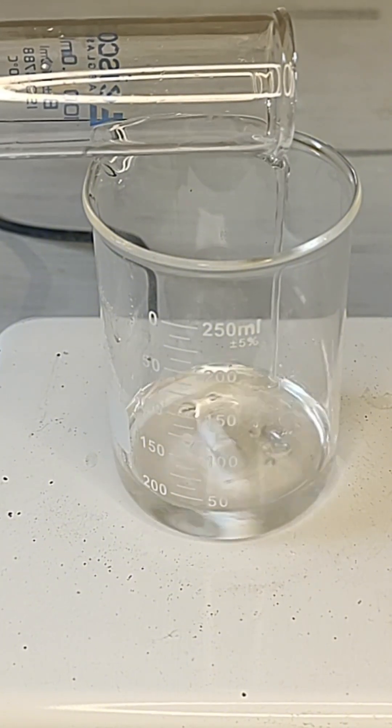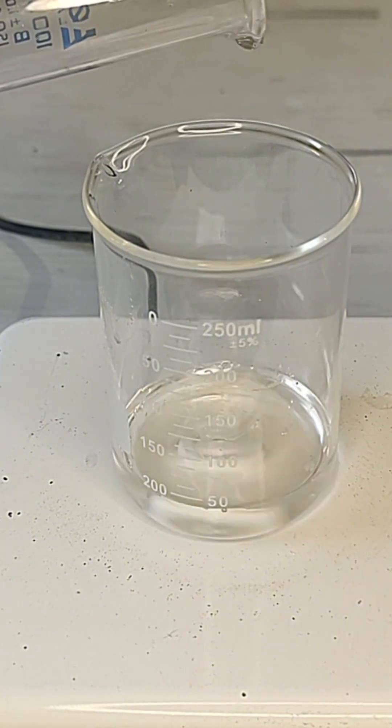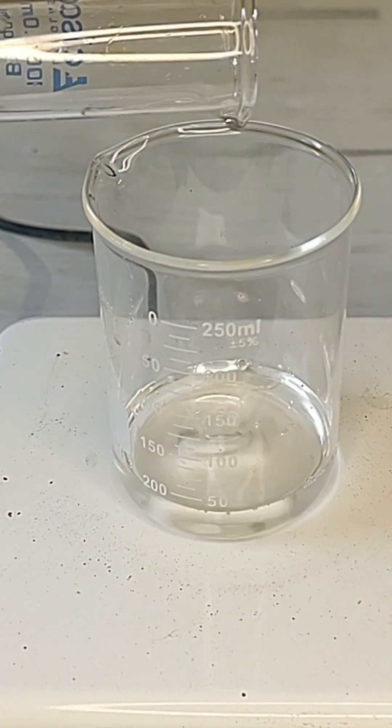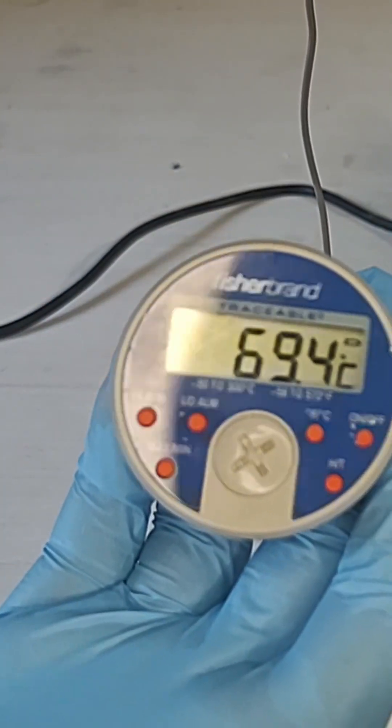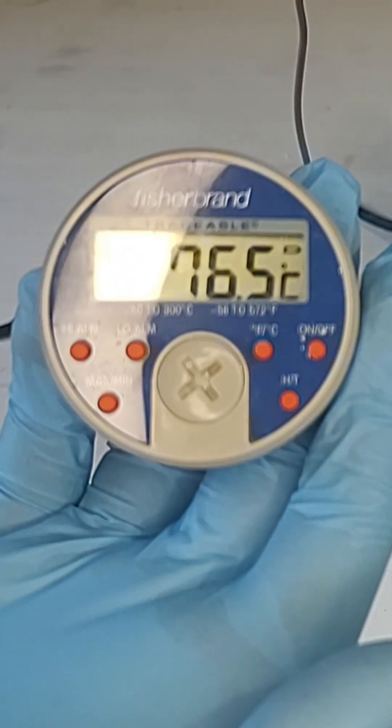Afterwards, I slowly added 10 milliliters of 35% hydrogen peroxide to the beaker. Strong stirring and slow addition are really important because of how hot the mixture can get. Both of these were ice cold and shot up to 75 degrees Celsius when they were mixed.